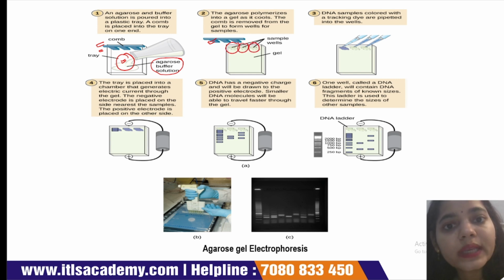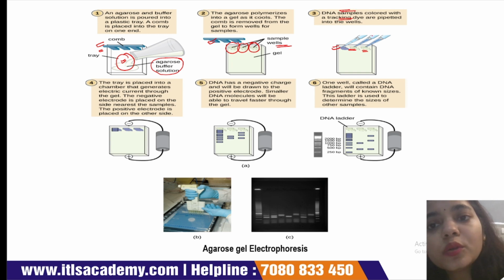These are known as sample wells. In these sample wells, we put our DNA. Here, we add the tracking dye with our DNA sample to track the DNA.